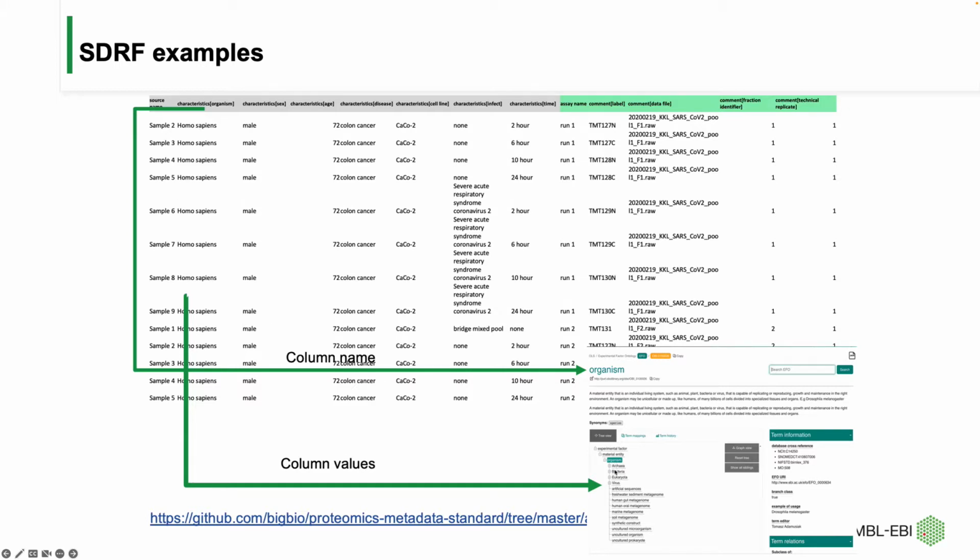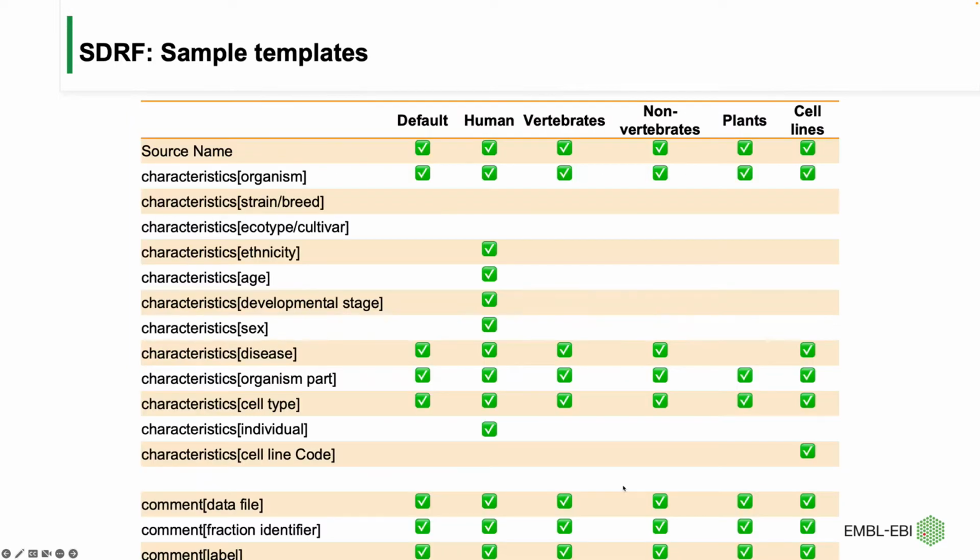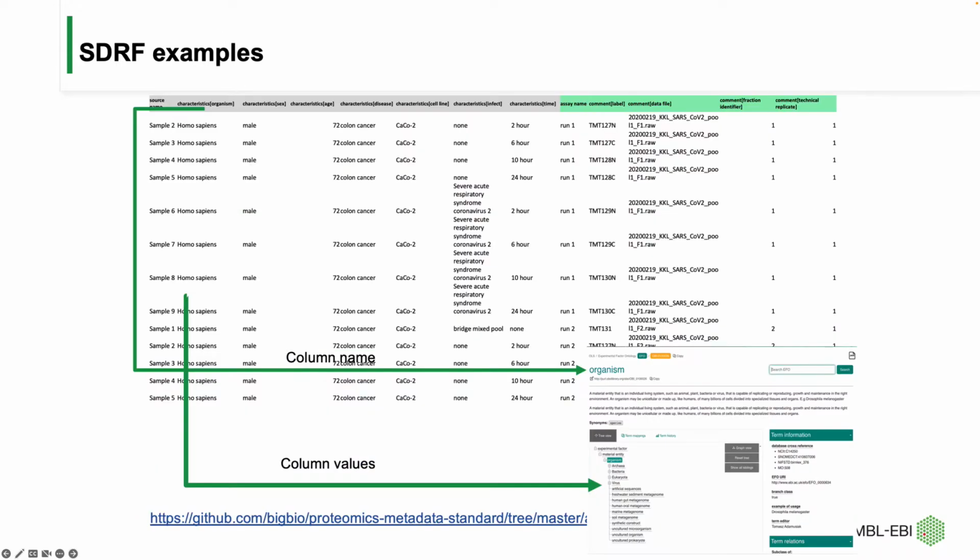This is really important because you need to have here the main property, which is an ontology term in EFO, but inside you have the properties of that ontology term. Then you need to interact quite a lot with EFO to describe your metadata.